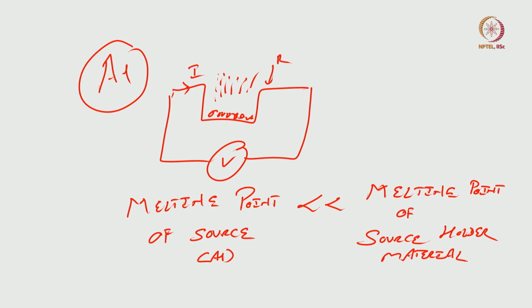This boat is our source holder, isn't it? Boat is our source holder.